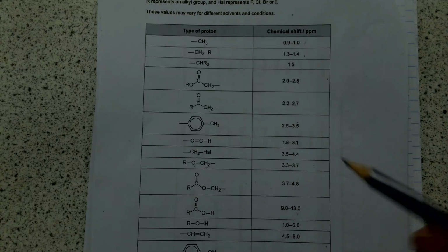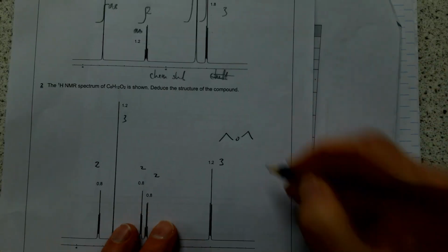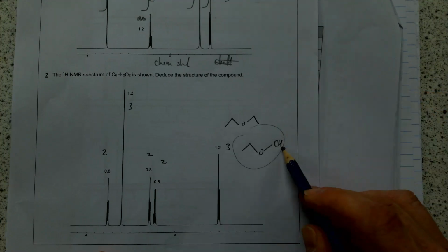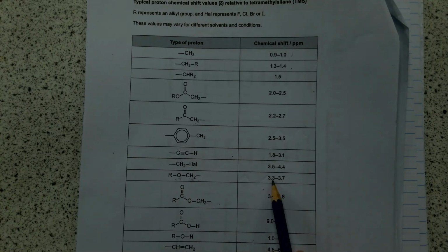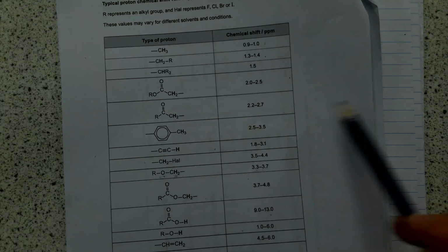So let's say I had this molecule, the kind of semi-seagull if you like, with this CH3. You'll go, well, this is a CH3 ether. Let's see if I can find that on there. Well, you won't find it, but the CH2 ether will be very, very similar. It'll be in that range as well. So don't be too upset about the fact the CH2s are given for these. I don't know why they've done that. This CH3 could be a CH2. It would give the same chemical shift.